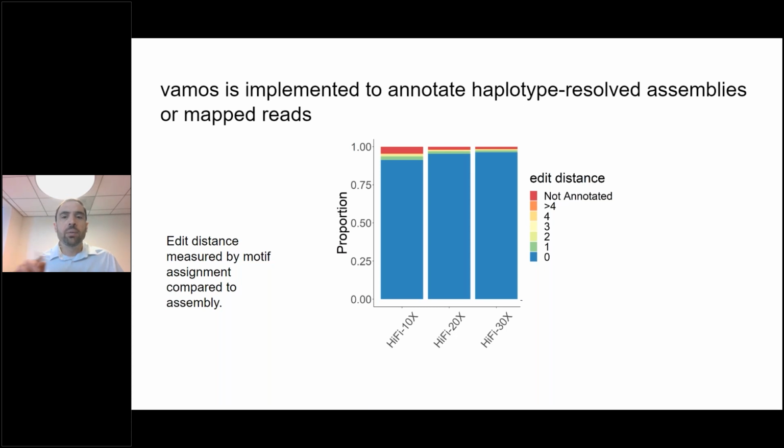We have just a couple of percent of sequences that were missing annotation based on lack of reads that overlap the sequence entirely. What you can see is once you get to about 20-fold coverage, you can get about as many regions called as at 30-fold coverage.